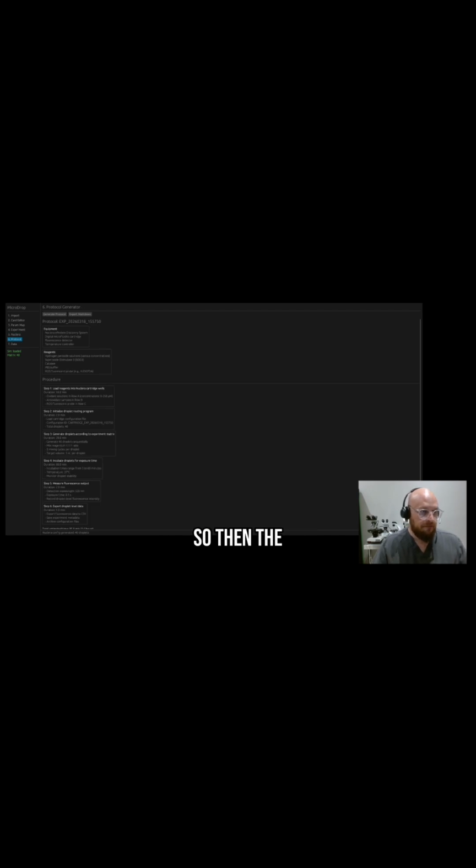Okay, then the protocol generator. This generates a protocol of what you should do. Here's your equipment, here's your reagents. You have your ROS fluorescent probe procedure, steps 1 through 6, which gives you an outlook. Then you can export this protocol in Markdown, and boom, here's the data.